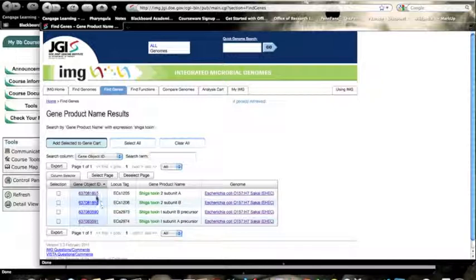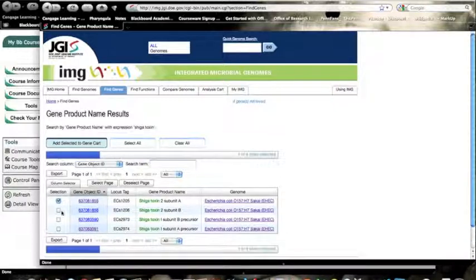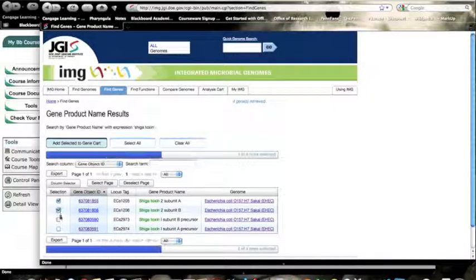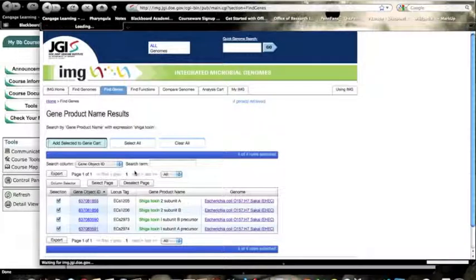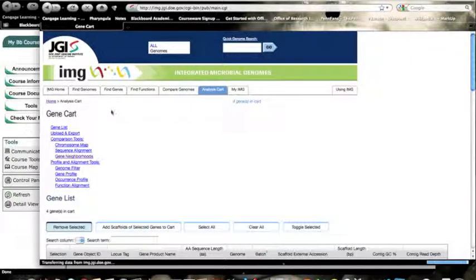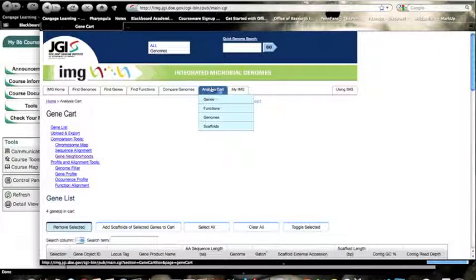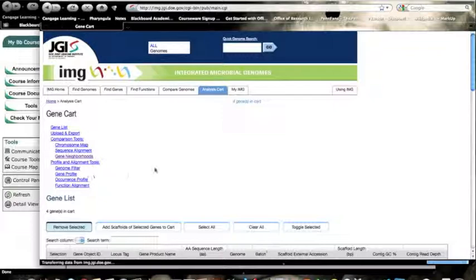It looks like we've got several gene objects here, and we're going to come back to that in a minute. But first I want to add these to my cart. So you select the ones you want, and it'll remember it throughout the session.